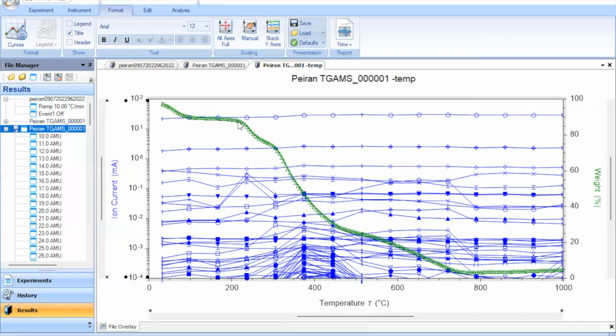So if we look up calcium oxalate and kind of understand the decomposition routes for each mass loss event, we'll have a general understanding about what we're going to expect to see. So for example, this first mass loss event should be just water. So if we start clicking on some of the peaks that have peak right here, we'll see that water with a mass of about 18 will have peaks that are around 18.